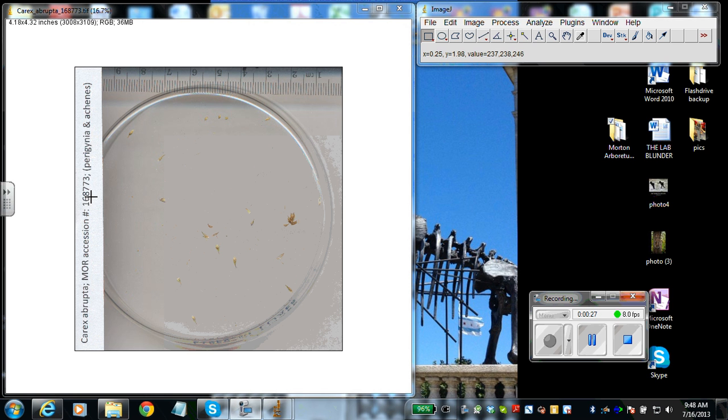And here's the accession number. So make sure that everything matches up for you when you're looking at the specimen that you're looking at. Obviously, you've done all the herbarium measurements. You're going to be doing this on your own. So this stuff all needs to match up.